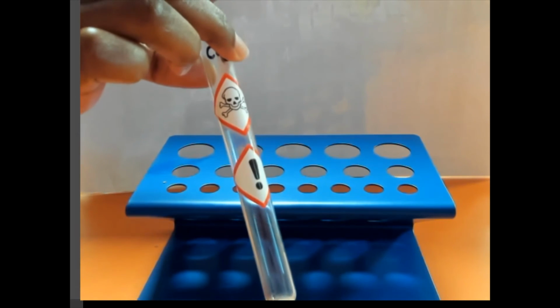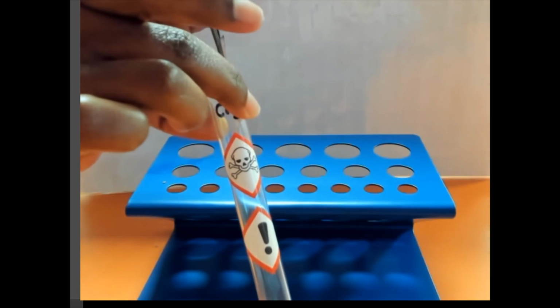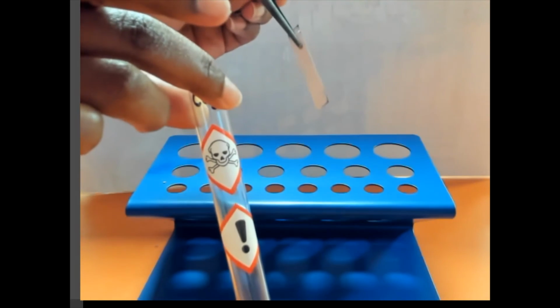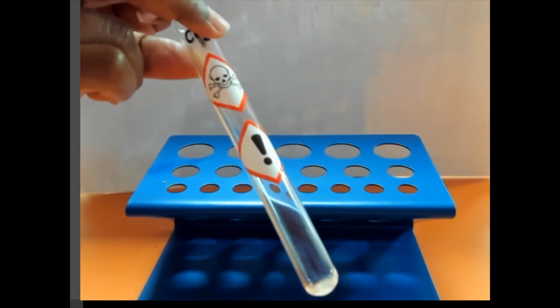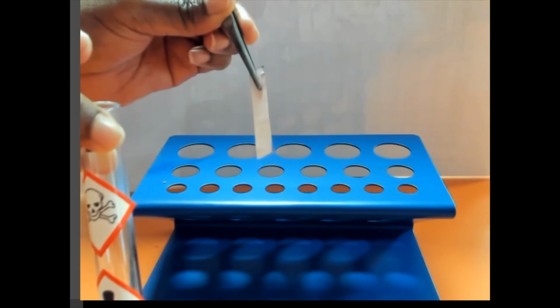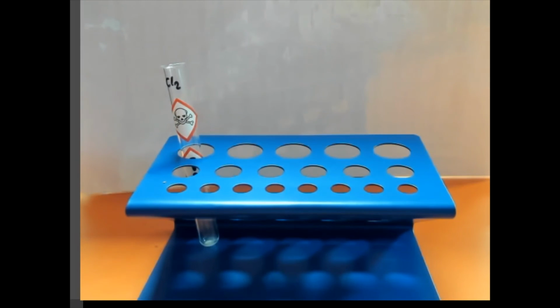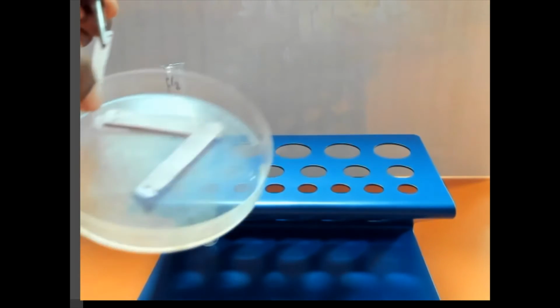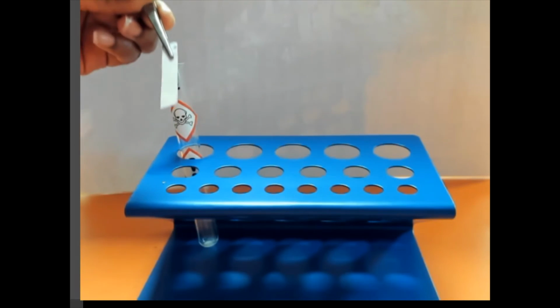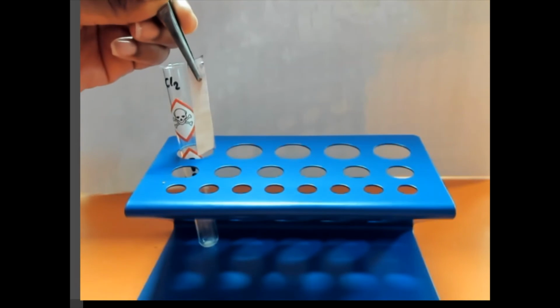Okay, so after a while, that should change to pink and then it's bleached to a white color. Hopefully that's clear enough for the camera. Yep. So at the beginning, the litmus paper looked blue, then gradually changed to a pinkish color, and now it's totally white.